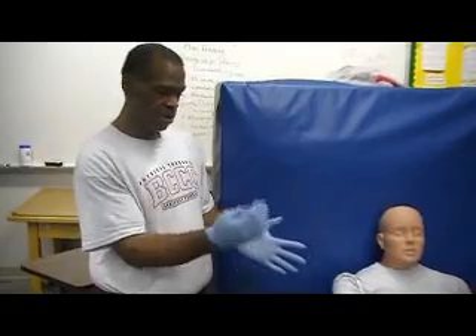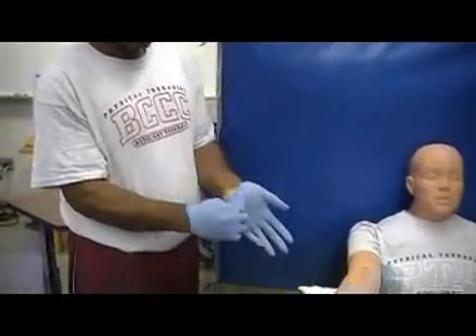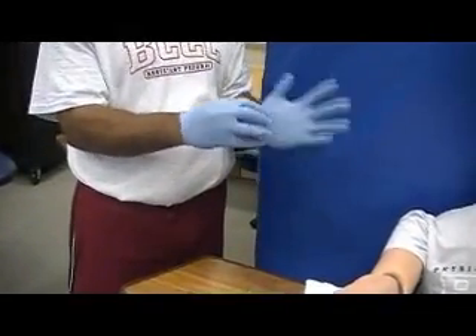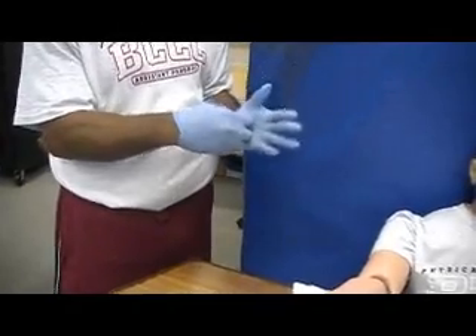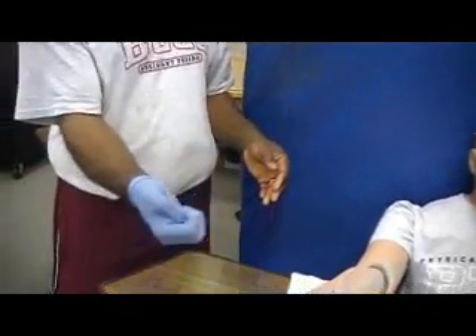We do not want to remove the glove by touching the skin. When it's time to come off, grab here in the center and pull the glove off, balling it up in the other hand.